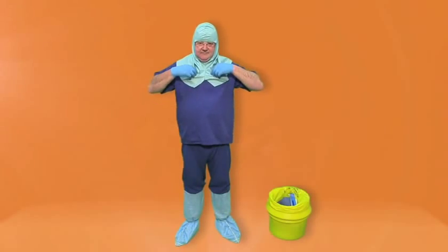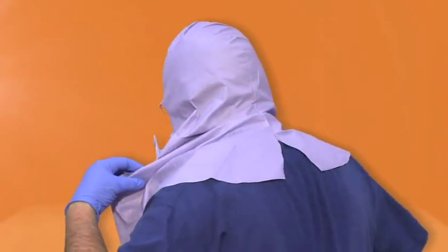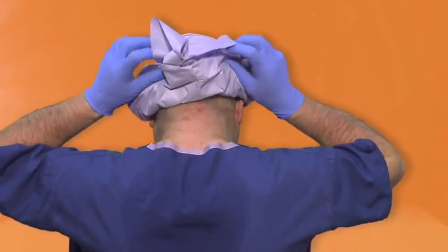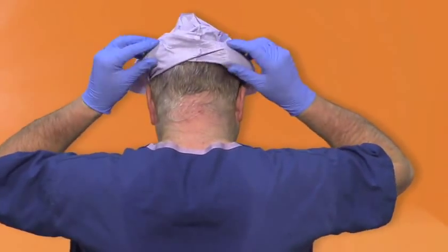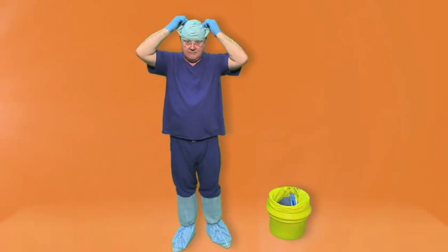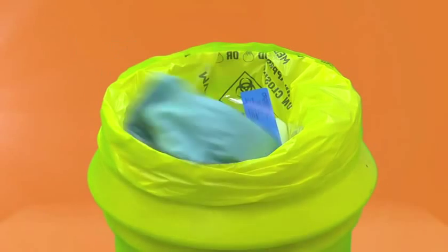Hood. Grasp the hood at the V at the front. Gently pull outwards to split the hood. Collect the surplus material and carefully peel the hood off. Wrap the hood so that the dirty side is now on the inside. Leaning slightly forward, remove the hood and dispose of it as clinical waste in a yellow bag.